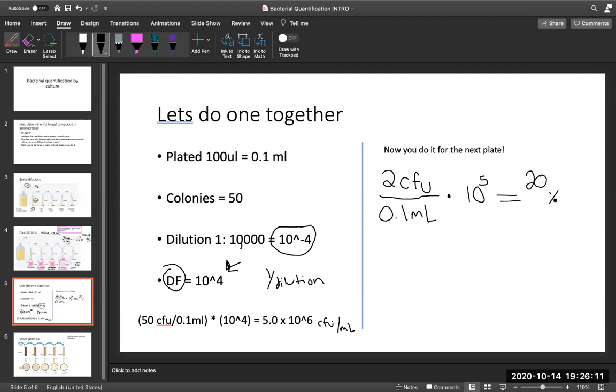And then you could say 20 times 10 to the 5th, or we could say 2.0 times 10 to the 6th. And again, that's CFUs per mil.